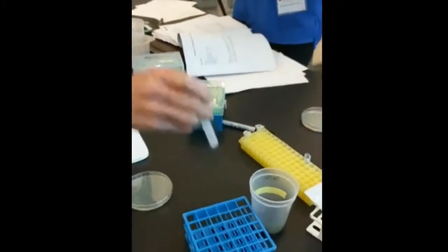Sprinkle 5 to 10 sterile beads onto each plate and gently agitate the beads so that the entire surface of the plate is covered with the cell suspension. Avoid a circular motion that will concentrate the cell suspension on the outer edges of the plate.